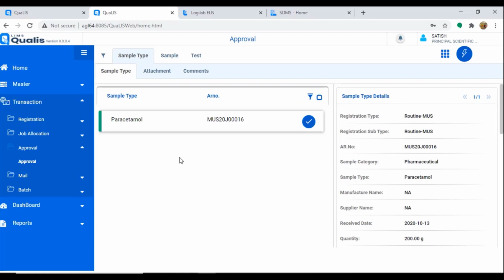Reports in our LIMS are a configurable area. The way we implement LIMS is we understand the reporting requirements of the customer, because every time we do the implementation, we have to touch the report at least for the header and footer. We have to add their logo. We have to add the report name, company name. So every time we deploy LIMS, we definitely have to work on the reports. So we study the report requirement and we design these reports and implement.